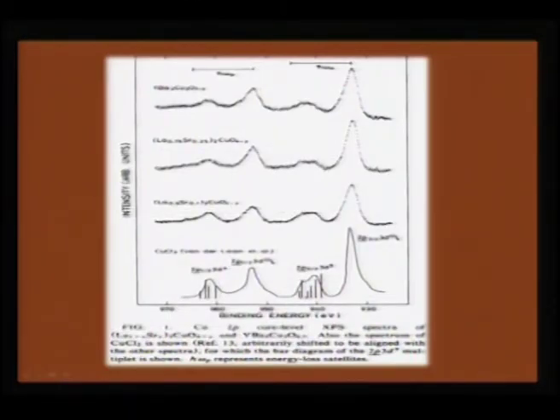So, if you make a comparison with a standard compound, cupric chloride, which is a well studied system, and reposition it to match the copper 2p core level spectra, you can clearly see that the copper 2p 3/2 and 2p 1/2 spectra are both split. In other words, they show a split in each peak.